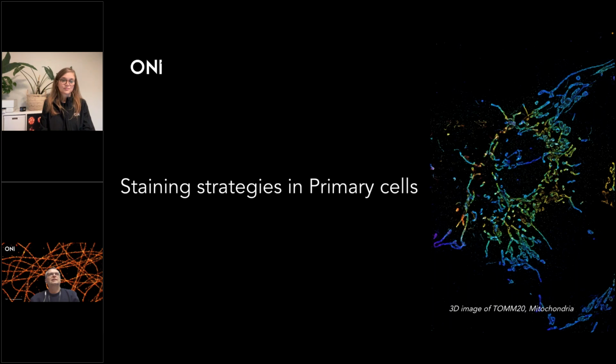And the reason behind that is that if you are using a conventional microscopy like confocal, you will make pretty much one snapshot of it with a low power. But in high resolution, you need multiple localizations to identify where your protein is, and that will be still within 20 nanometers. So if your protein is low expressed, you can enhance the number of localizations from that protein by using a secondary antibody, which has multiple fluorophores. And most of the time, you have multiple secondaries attaching to the same primary antibody. So in this case, I would recommend to use an approach of a primary and secondary.